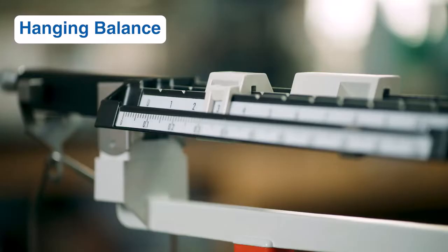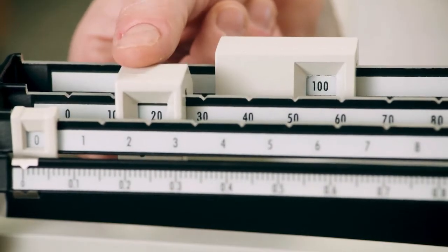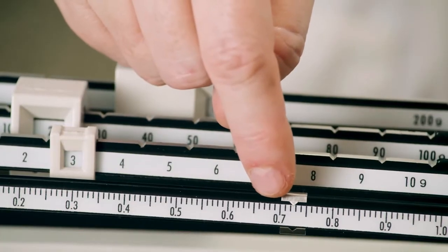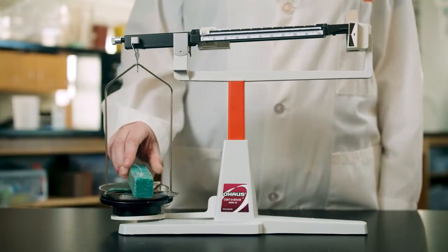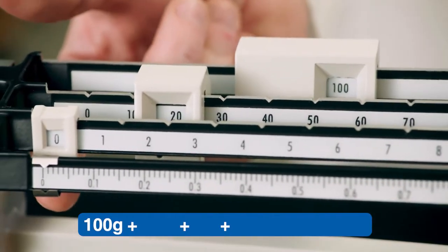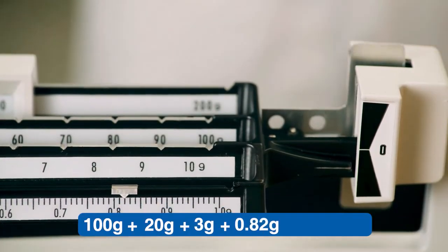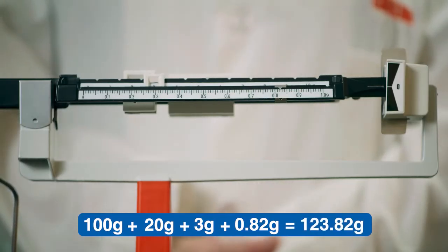The hanging pan balance is another tool to measure mass. It works the same way as the triple beam balance. Again, you move the masses on the beam from highest mass beam to lowest mass beam until you get the balance to rest at 0. As with the triple beam balance, you read the value on each beam and add these values together to get the mass of the object. In this case, 100 grams, 20 grams, 3 grams, and 0.82 grams when added together equals 123.82 grams.